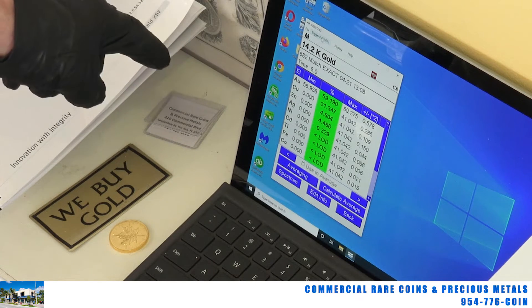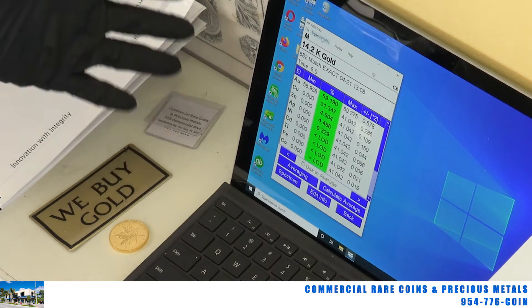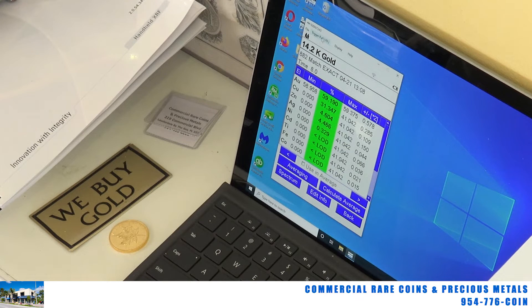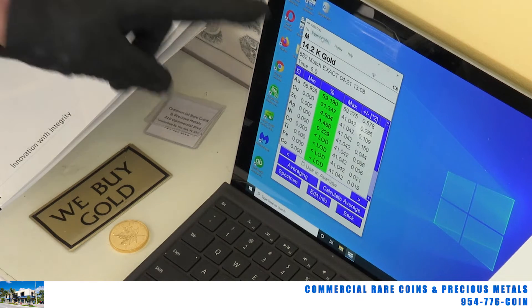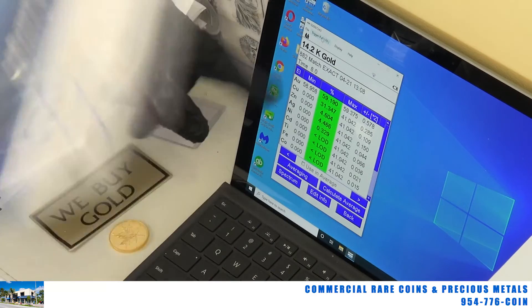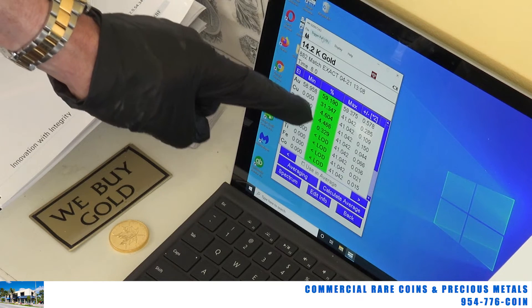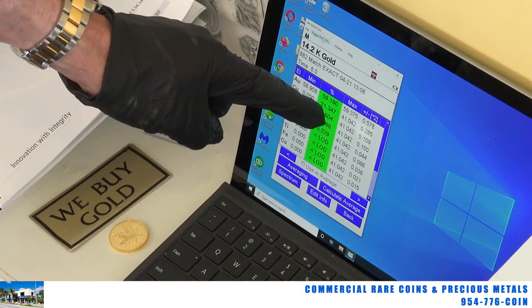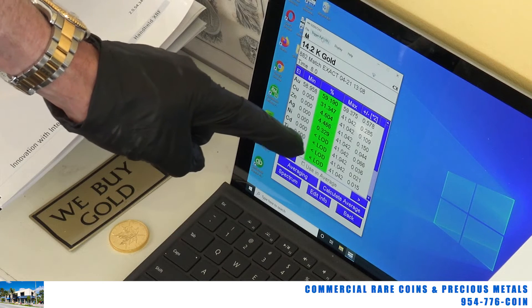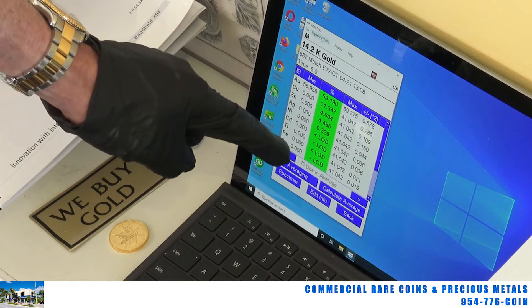Remember, this machine only reads up to 10 microns into the surface — very, very little, like a hair's width or maybe less. It doesn't tell me what's inside the item. What we're reading on the surface of this chain is 14.2 karat, showing up as 58.95% — plum would be 58.5%, so that's coming up correct. You've got copper there — CU — so 31% of that chain is showing up as copper on the surface, plus a little bit of zinc, a little bit of silver, and a little bit of nickel.